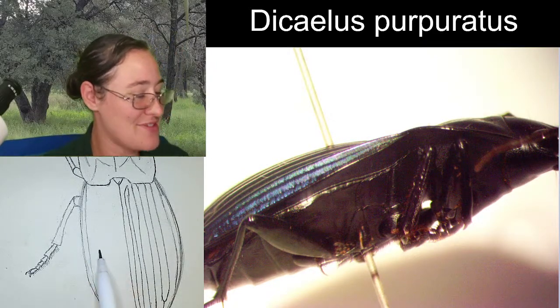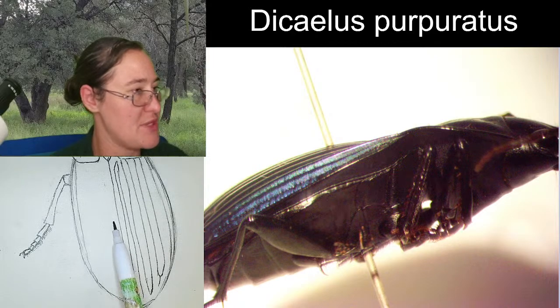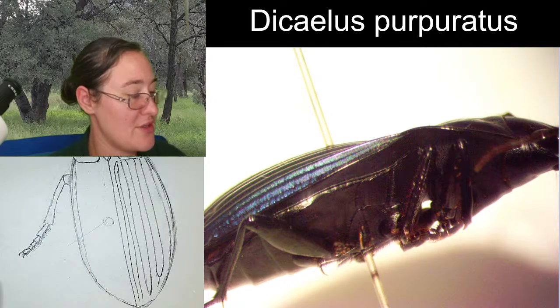And then you have some distance. So if the front leg's here, the middle leg's right around here, the hind leg is actually going to be connected, the coxa is right around here. And it's coming out in this direction.